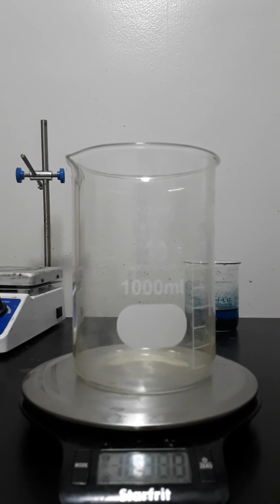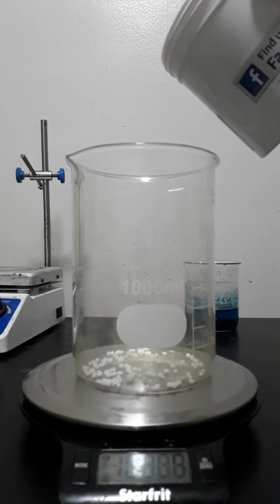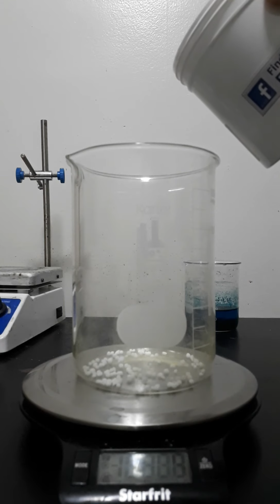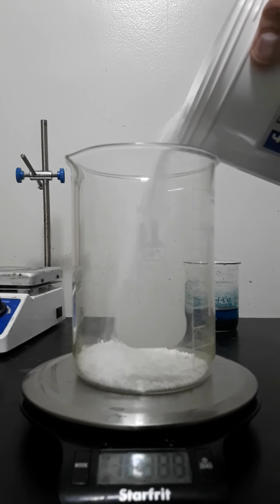Okay, so in order to start, I'm going to weigh about 400 grams of calcium nitrate. What I forgot to tell you is that even getting calcium nitrate is a little bit hard in Canada, although it's often sold as nitrate fertilizer. So it's the 15.5-0-0 fertilizer, if you're wondering.